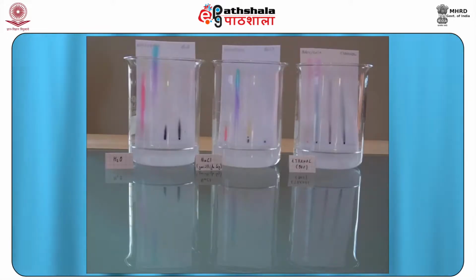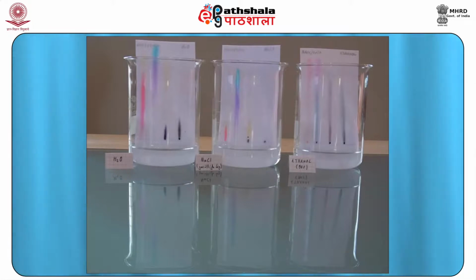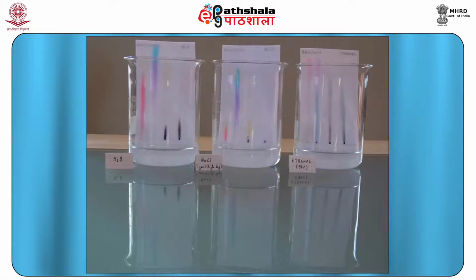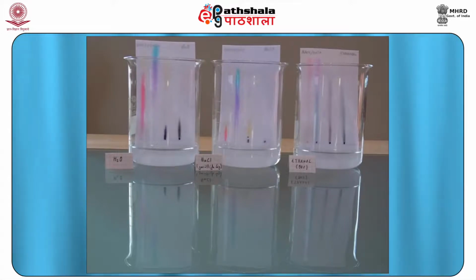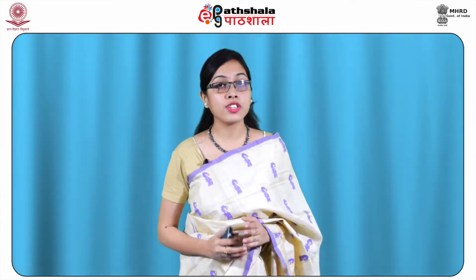In thin layer chromatography, or TLC, the stationary phase is a thin layer of finely divided adsorbent solid spread over a glass plate. The mobile phase is liquid. In gas liquid chromatography, or GLC, separation is achieved by partition between a mobile gas phase and a stationary liquid phase on a solid support, packed in a column.